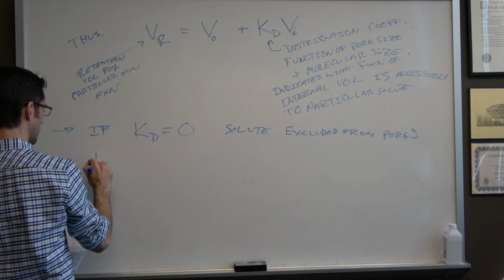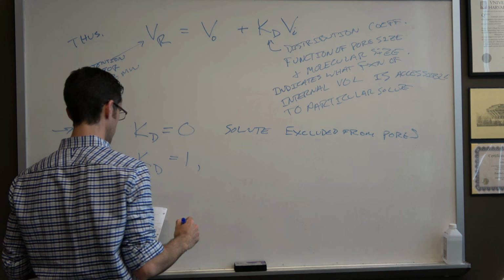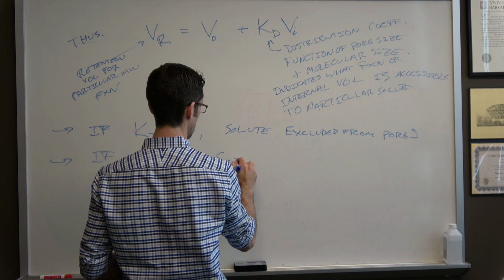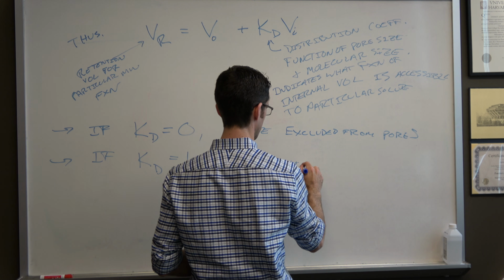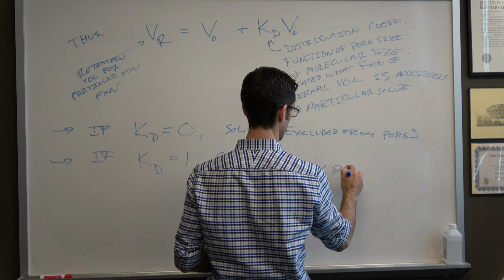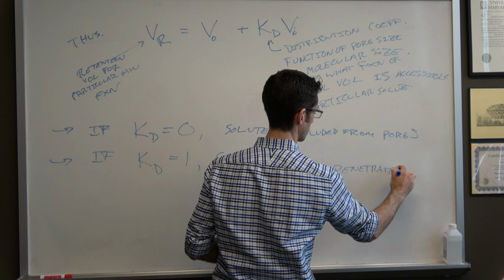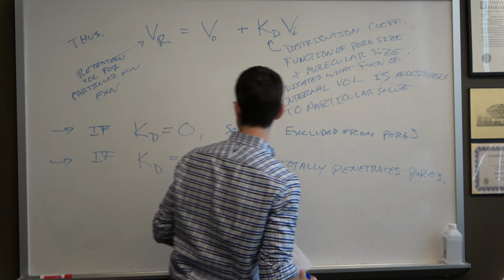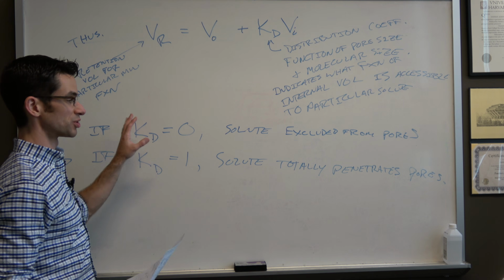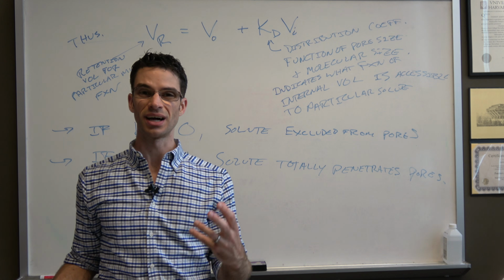And the other limiting case is that if Kd equals 1, the solute totally penetrates the pores. Now ideally we want a Kd that's between 0 and 1 so that we get some retention but not complete retention.